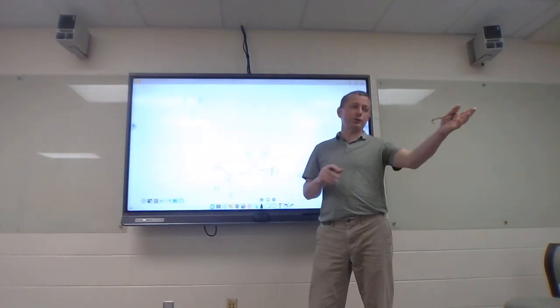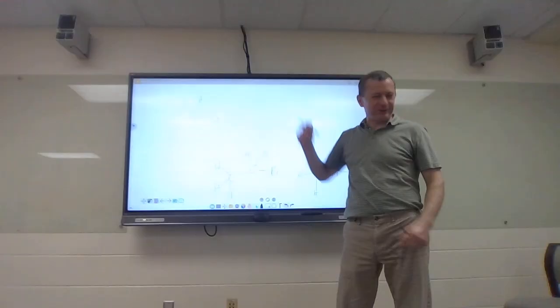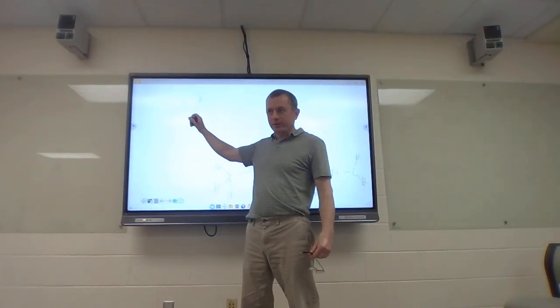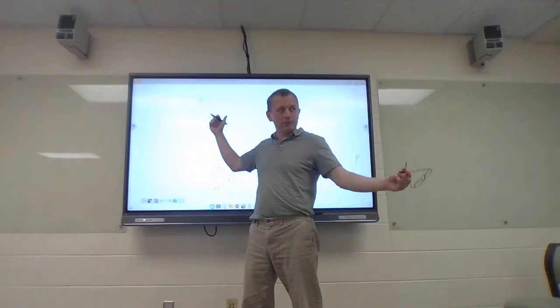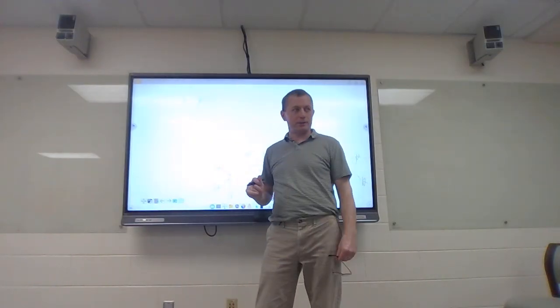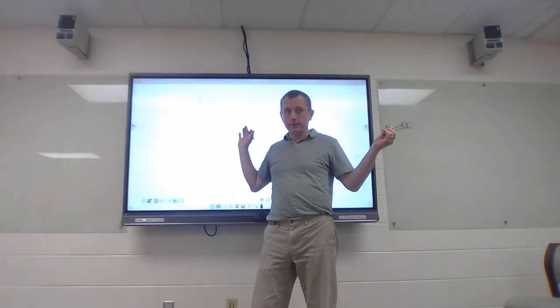I'll show you one here as we flip the page. But I did this one first for a reason. So I'm looking at, just like with the bromine there, right? Similar range, everything looks the same. Why not just say hydrogens next to an oxygen? Integrates to 2, I can make that work.